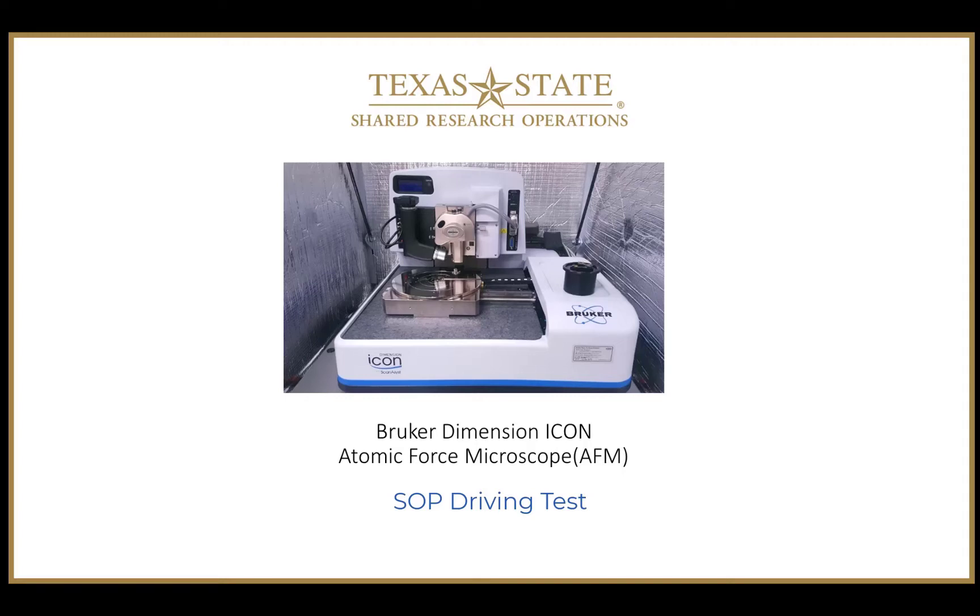This video has been created to demonstrate how to perform an experiment using the Bruker Icon AFM in basic tapping mode. Like any of the instruments in SRO, it is critical that users carefully follow the SOP in addition to watching this video.